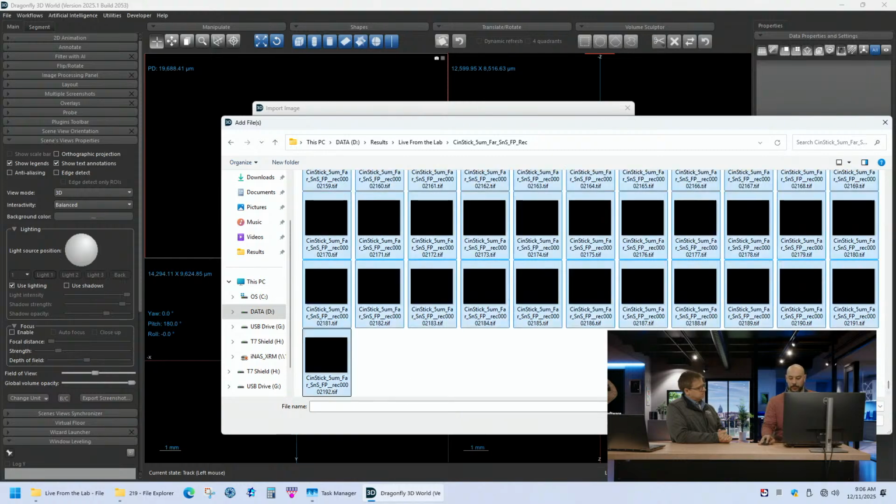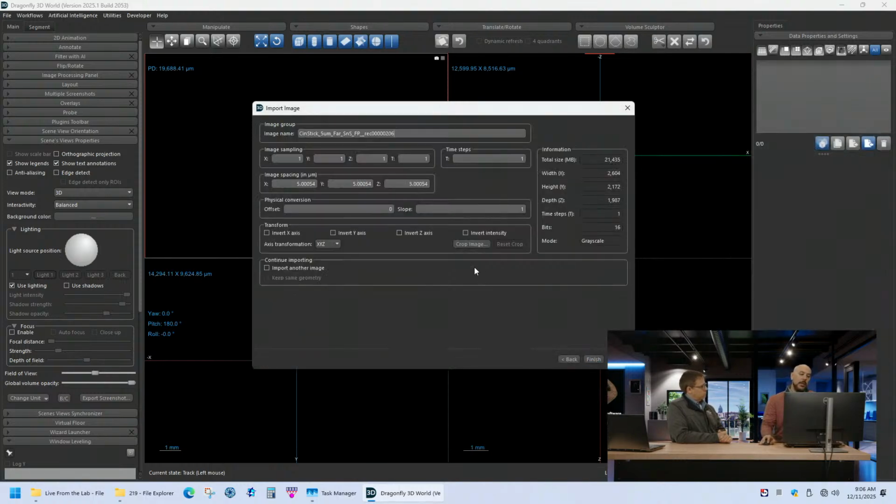It's whatever you prefer. Which one do you normally use? So it depends on what you're looking for. These are TIFF files. These are 16-bit images. The 16-bit allows us to retain more data on the histogram. So if you want to do segmentation, then I would probably go with 16-bit. 8-bit is perfectly fine. It just depends on what I'm looking at. I'll do both. It doesn't really matter, honestly. It also depends on how sharp the features in your histogram are. So if you really want better delineation between your phases, maybe go with 16-bit. That's probably the better way to go.